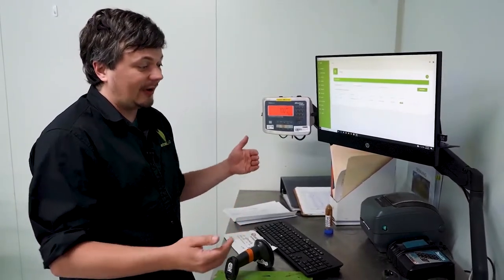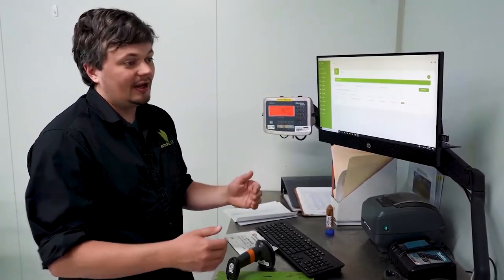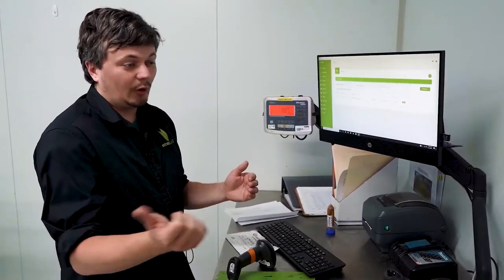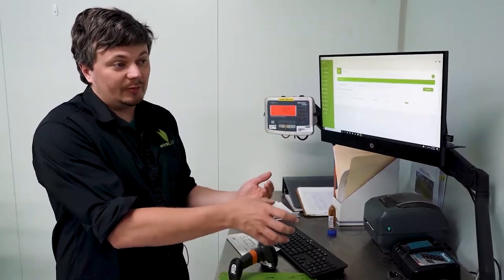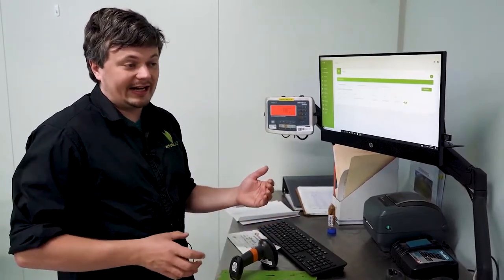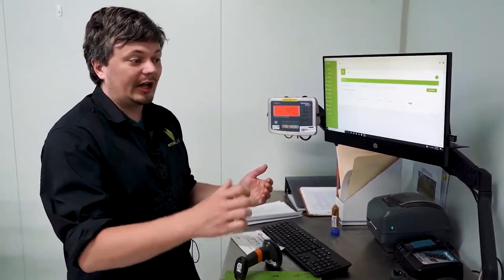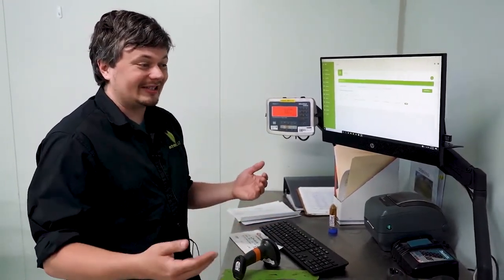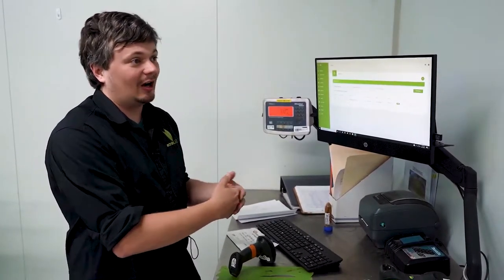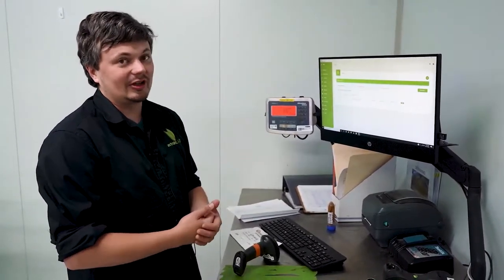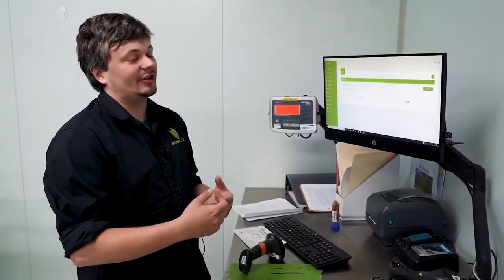At each process, you have an input, you have an output, what it gets turned into, and you potentially have waste. Output and waste obviously need to equal your input. Otherwise, the system is going to get very crabby at you.